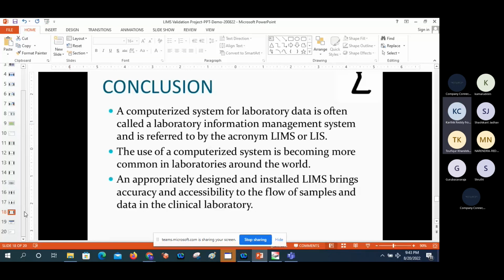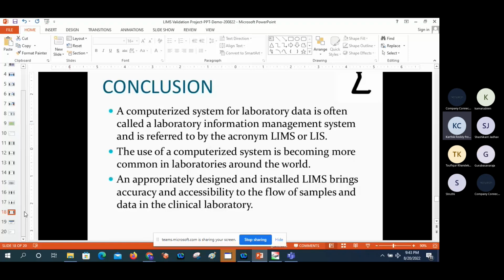If an end user gets a job in this kind of company where they are doing LIMS validation, how would this course help, because he doesn't have the experience in master data creation and admin level, right? So this course would help that person if he gets into a technical interview. So master data creation, I will explain end to end for all types of modules.